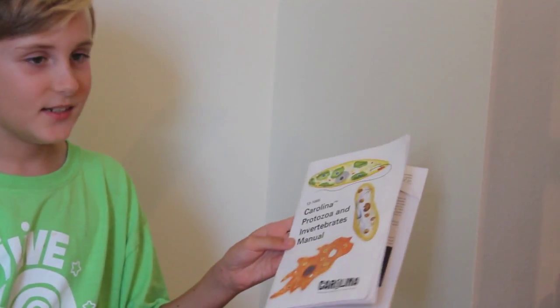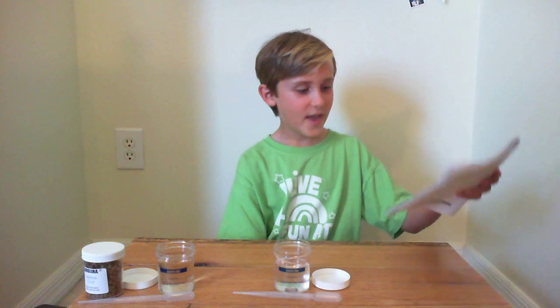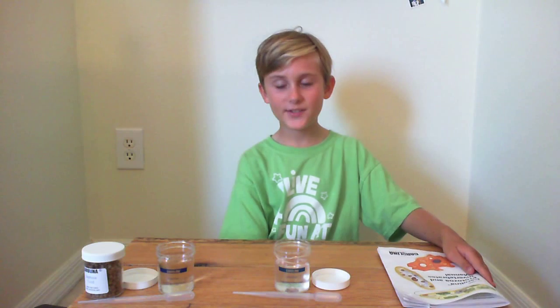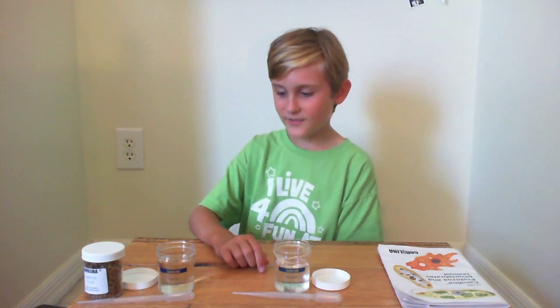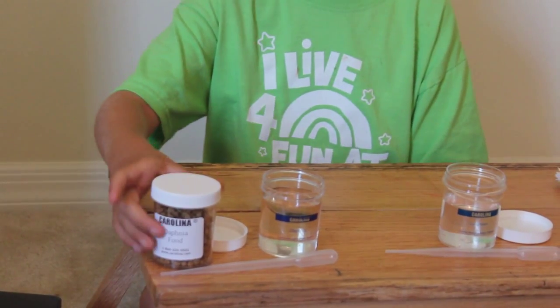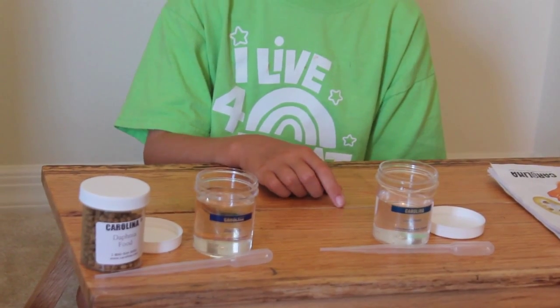The animals also came with this nice printed Carolina Protozoa and Invertebrates Manual. And although it was extremely detailed about some parts, the Hydra especially was very vague. Apparently, the Hydra and Daphnia cannot live in the same container because the Daphnia food makes the water very cloudy, and the Hydra need to live in very clean spring water.